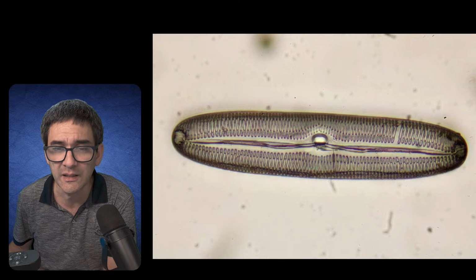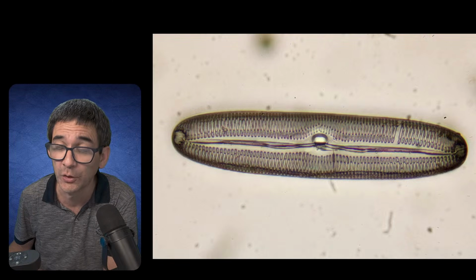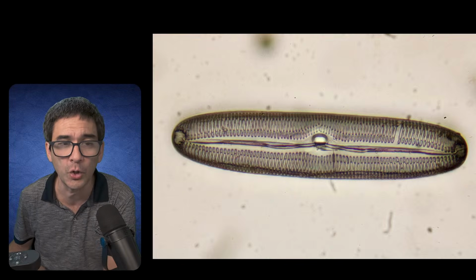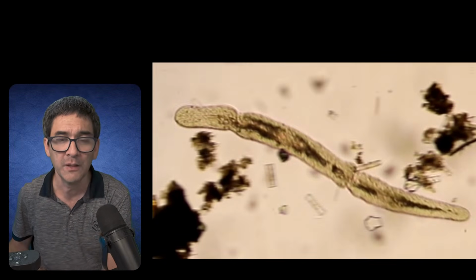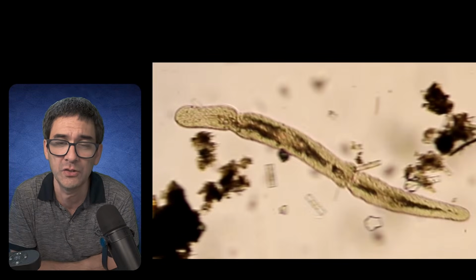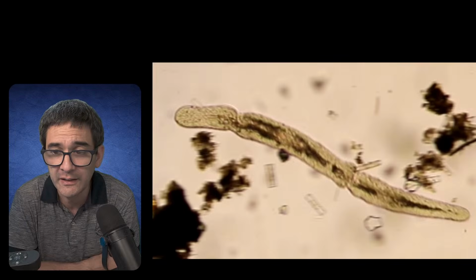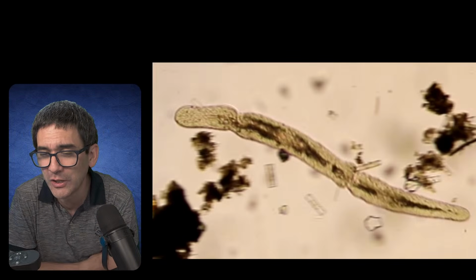And the second image I want to show you is some kind of a worm. It's from the same pond that the diatom is from. I tried using 3 different AI services to identify it, and I got 3 different answers. Yeah, so that's also something that I've tried to do: you copy paste the picture. Here's the worm, the screen capture. You copy paste the picture into an AI system, and you ask it to identify it. And yeah, Mike is in the chat.